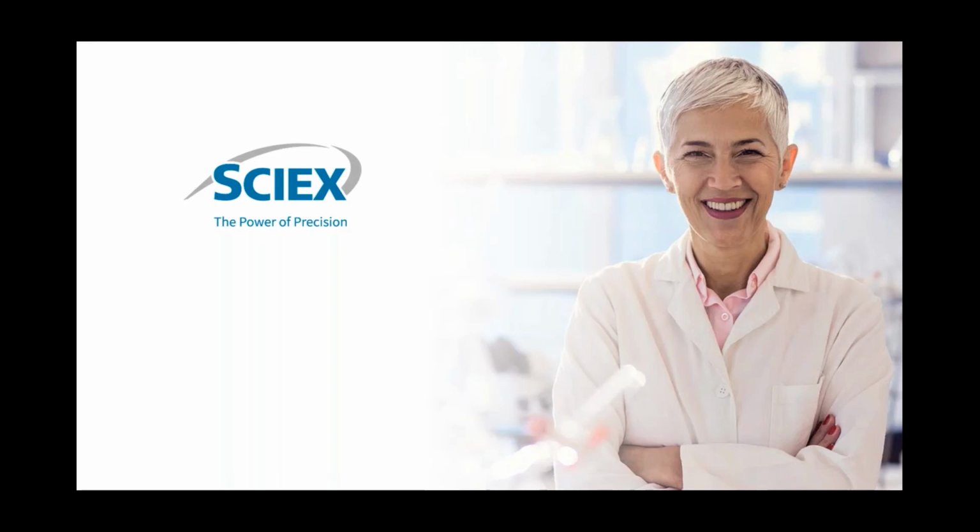That's also a goal for our plans for incorporating other software that we produce, including SCIEX OS. I mentioned MultiQuant. We do have other software that will come under that umbrella. So we're very conscious of that.